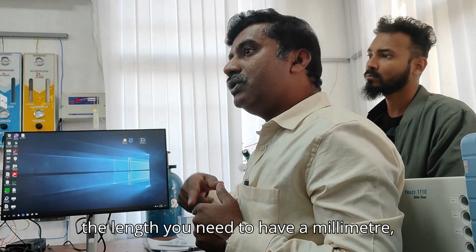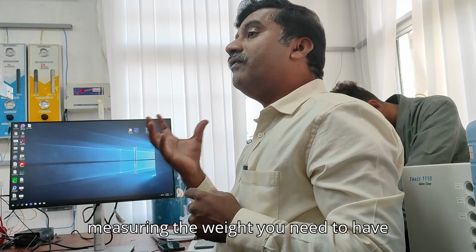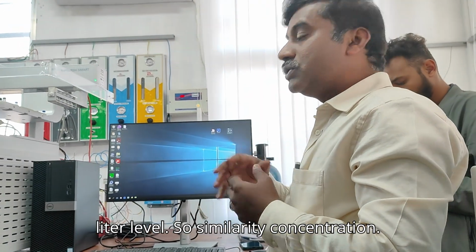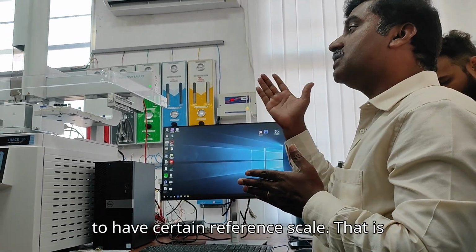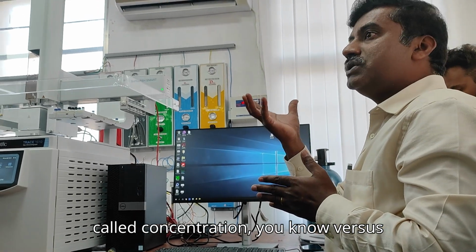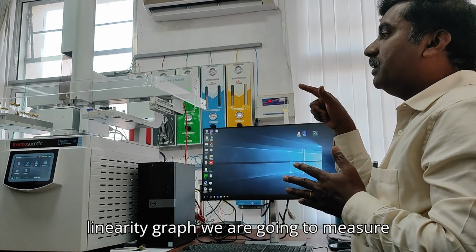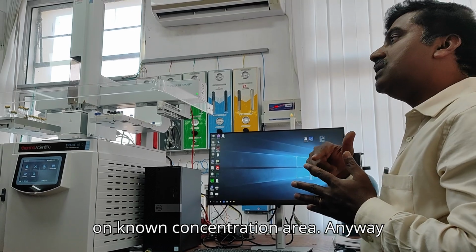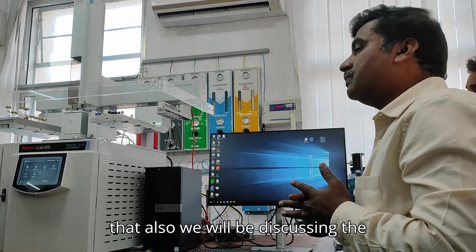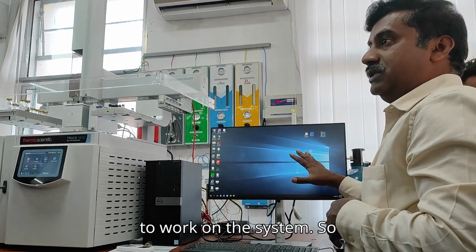To measure the length you need a millimeter, centimeter, feet and all these things. To measure the weight you need gram and so on. To measure the volume you need a liter. Similarly for concentration, to measure the concentration we need a certain reference scale. That is called concentration versus area response. Based on that linearity graph we are going to measure the unknown sample quantification based on known concentration and area. Anyway, that also will be discussed in the calibration protocol, so that we are going to work on the system, right?